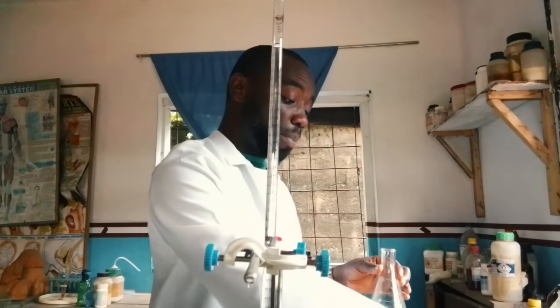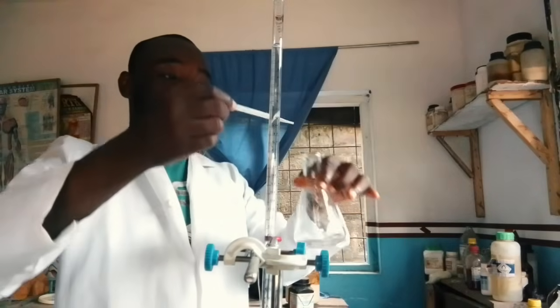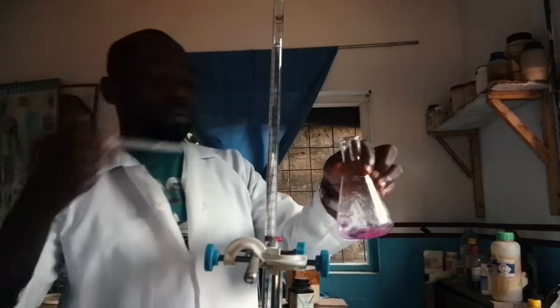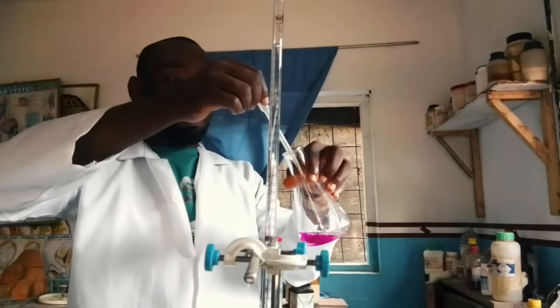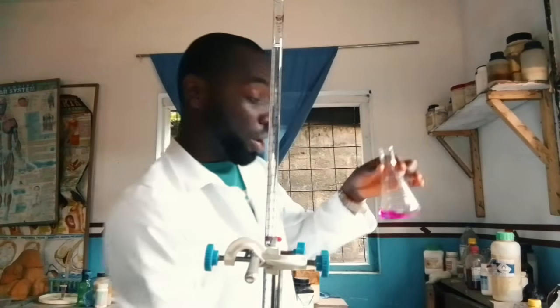So I will take my phenolphthalein. Remember what we are using is phenolphthalein. I will add few drops of phenolphthalein. Can you see it? Now after adding the phenolphthalein, we have a purple color. Now the next thing you do is you begin to titrate.